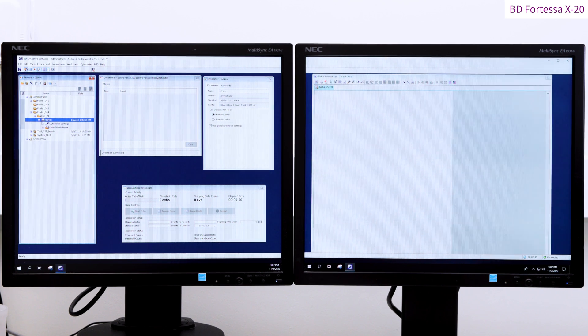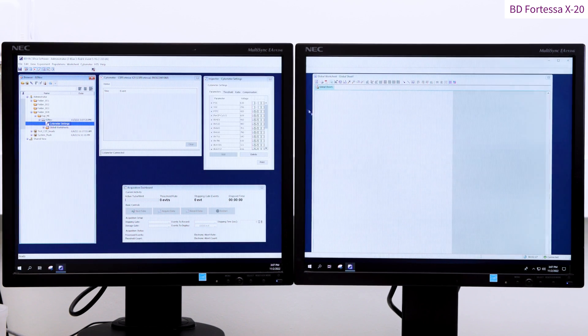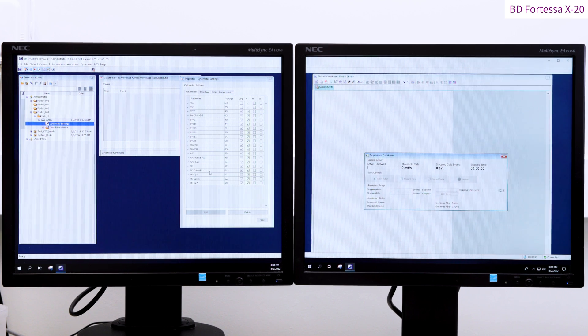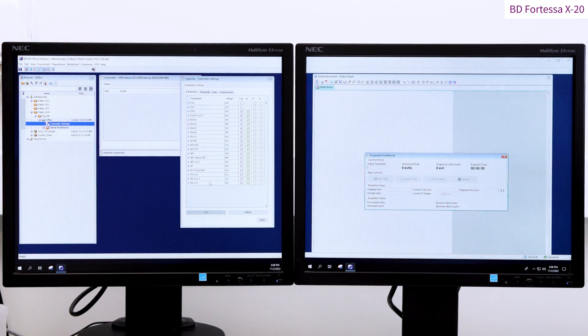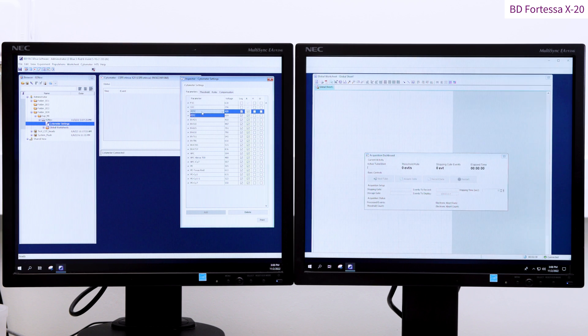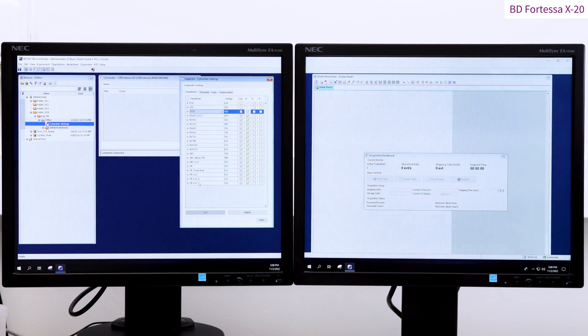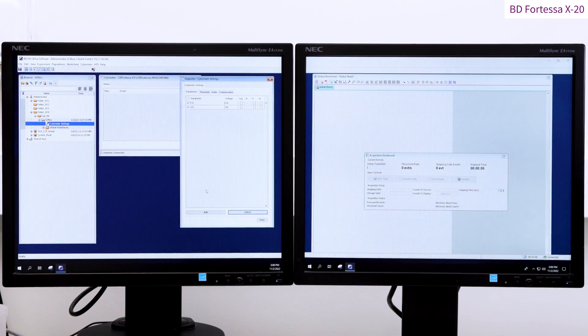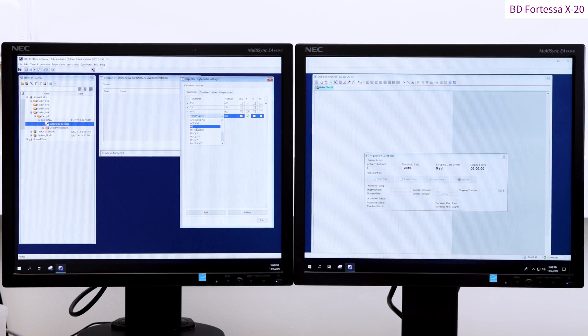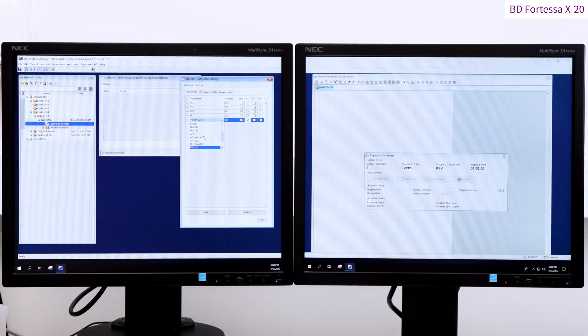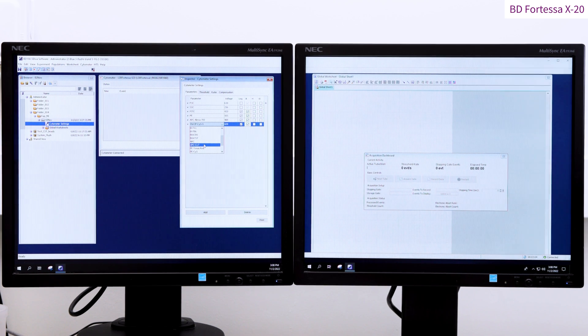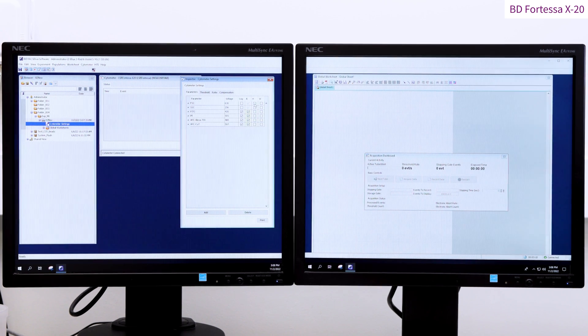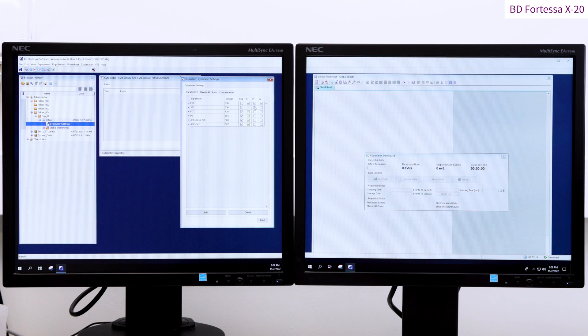A click on the Cytometer Settings tab will give you access to the Fortessa parameters inside the Inspector window. From here, you can delete or add in parameters. Here we have FITC, PE, APC AlexaFluor 700 and APC Cy7.